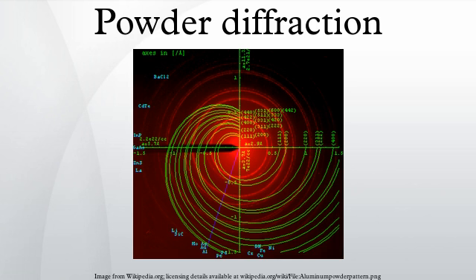Powder diffraction data are usually presented as a diffractogram in which the diffracted intensity, I, is shown as a function either of the scattering angle 2θ or as a function of the scattering vector length q. The latter variable has the advantage that the diffractogram no longer depends on the value of the wavelength λ. The advent of synchrotron sources has widened the choice of wavelength considerably. To facilitate comparability of data obtained with different wavelengths, the use of q is therefore recommended and gaining acceptability.